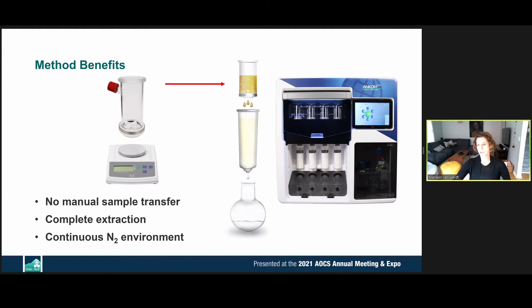The SPE column is a silica-based sorbent that retains the aqueous component of the saponification solution. The instrument then automatically fills the digestion vessel with solvent from reservoirs at the bottom right of the instrument. A few small additions followed by larger hexane additions wash the analyte into round bottom flasks at the bottom.